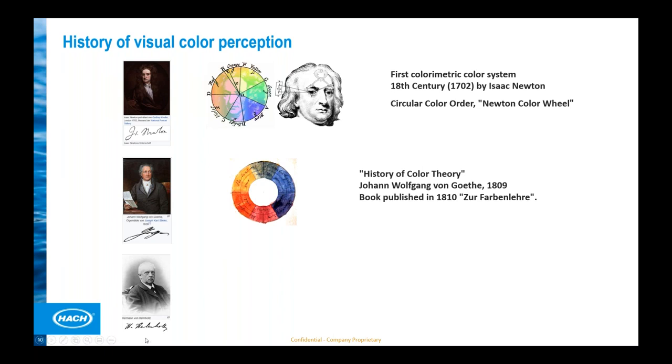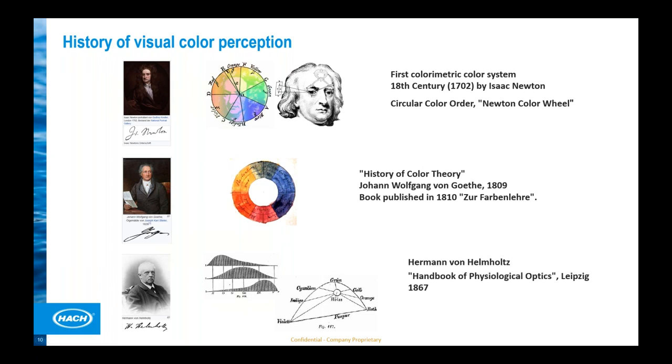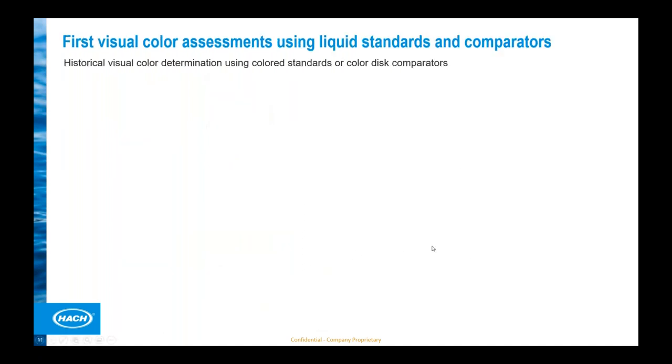More a mathematic-based approach to measure color and also intensity of the colors, and that is also based on a German mathematician, Hermann von Helmholtz, who started to develop a theory about this whole topic, based on a little bit older theory of Thomas Young. It's the Young-Helmholtz theory, really to have a basis to calculate, and we will see much more information about this later on in the theoretical part, really to calculate the intensities and also to combine and to compare the different intensities based on the LICO measurement system.